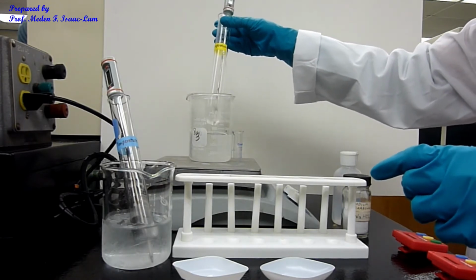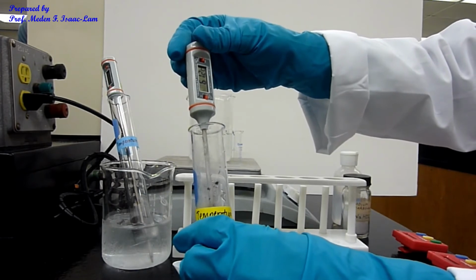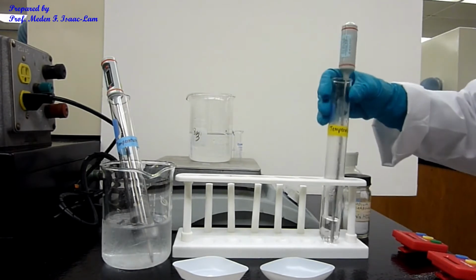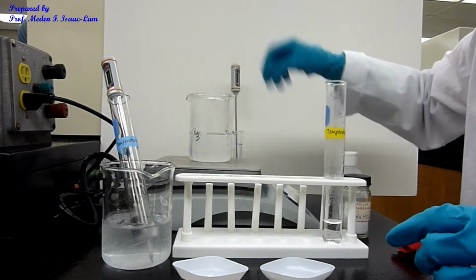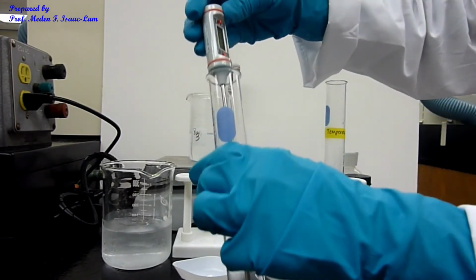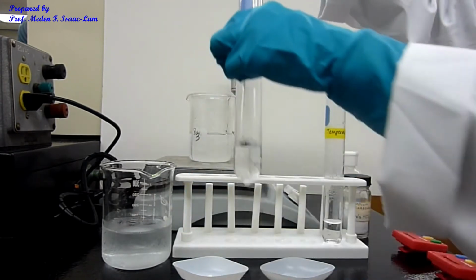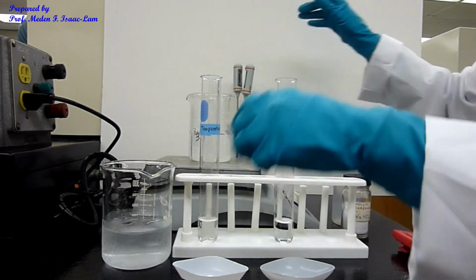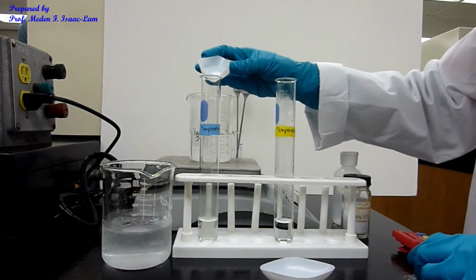So the temperature right now is about 61. And then I'm going to put it here. And the temperature again for this one, lower temperature, is about 7.6. And now I'm going to put in the first one, low temperature, and then I'm going to set the timer.